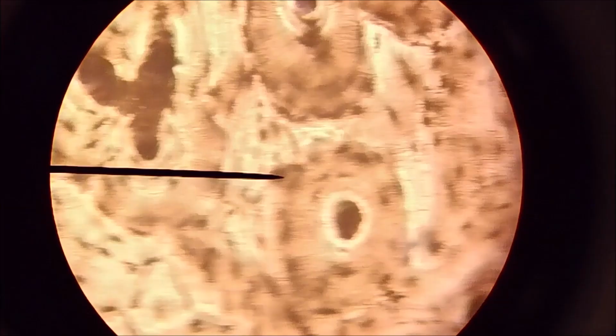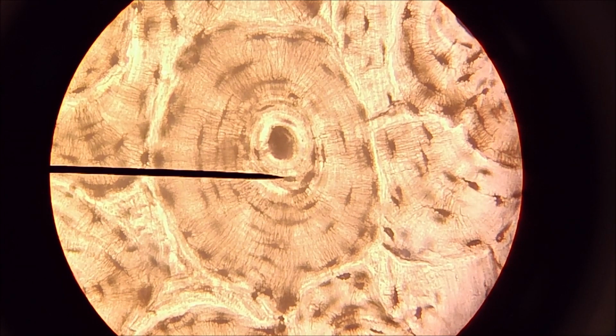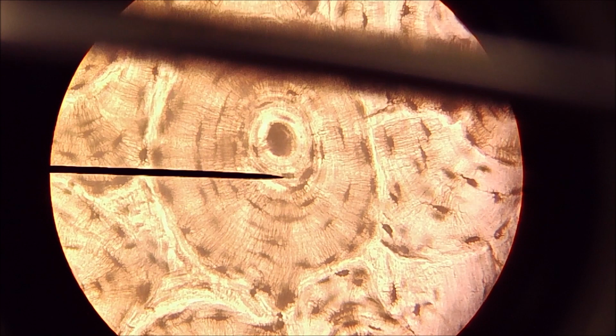If I zoom this way on in, you get these just beautiful images of bony tissue. That's just gorgeous. Osteon. So pretty right there. Now, look at this. What we have here is osteocytes. All these are called osteocytes. That's what the black things are. Osteocytes are bone cells. They live inside openings called lacunae. And then in the middle of this, right there, that is a central canal.